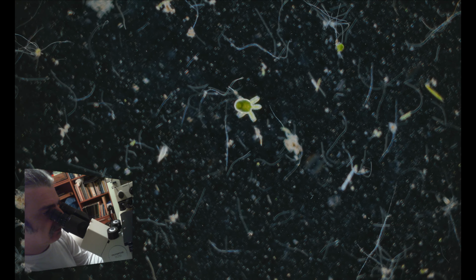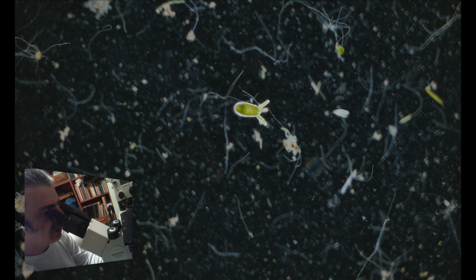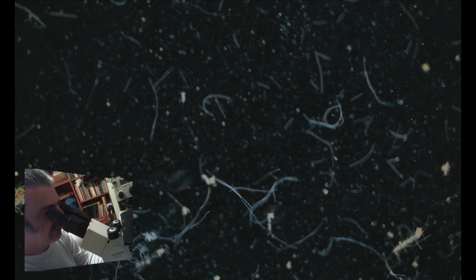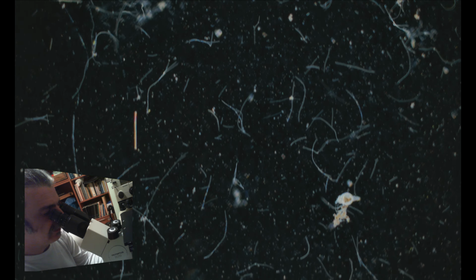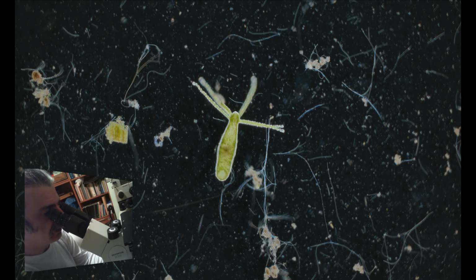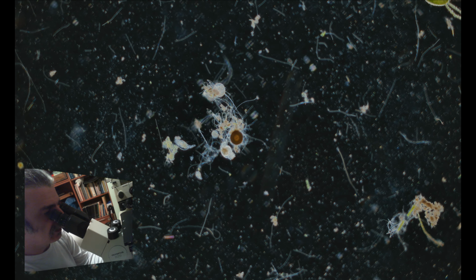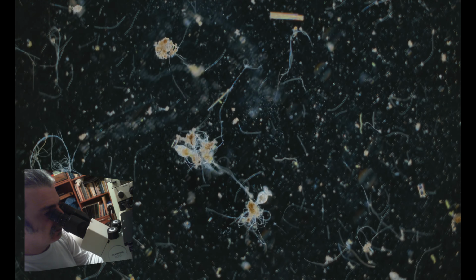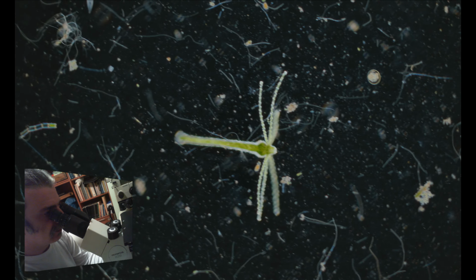Here is another hydra. It's in the process of the so-called walking. They can walk and hop. Here is another rotifer. All the squiggly lines that you see are probably cyanobacteria. We'll see it later. Another hydra. Another Arcella testate amoeba, and a rotifer beside it. Here is another rotifer. Another hydra.